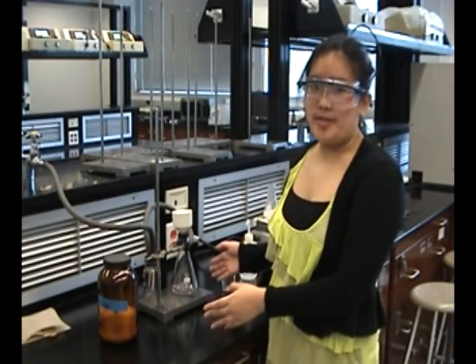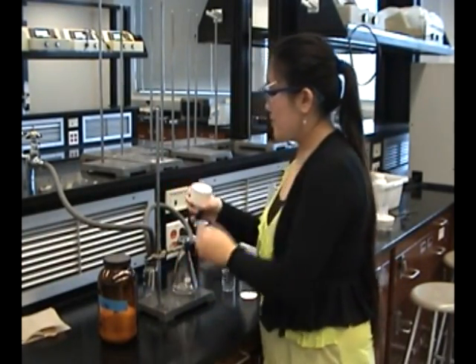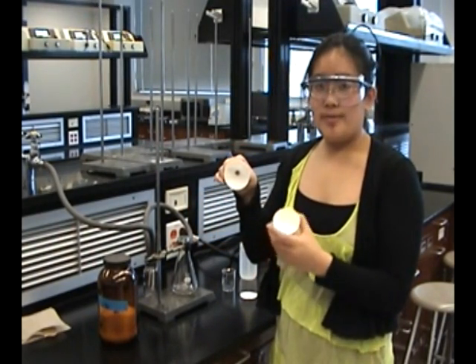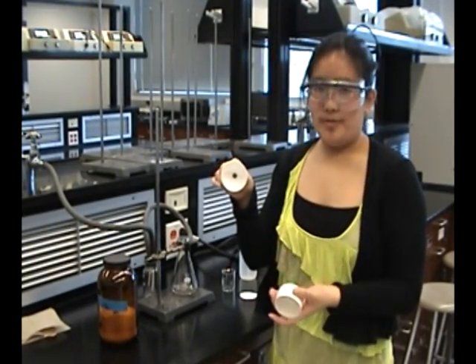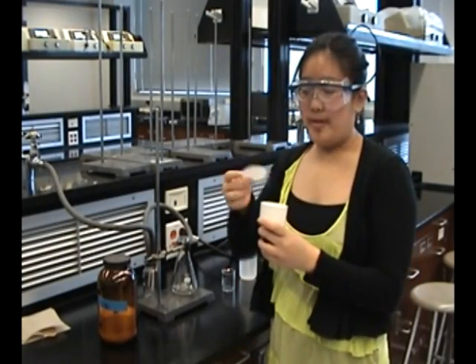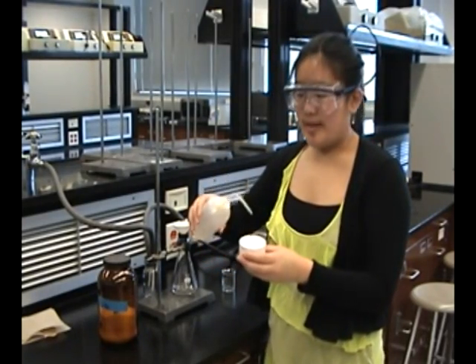While your solution is boiling, set up your vacuum filtration. When you're cleaning your vacuum filtration, make sure that the funnel is really clean and not clogged. The reason for this is because if there's something clogged in it, then it will take your solution longer to filter. Then put a piece of filter paper into the Buchner funnel. Wet it with some DI water.